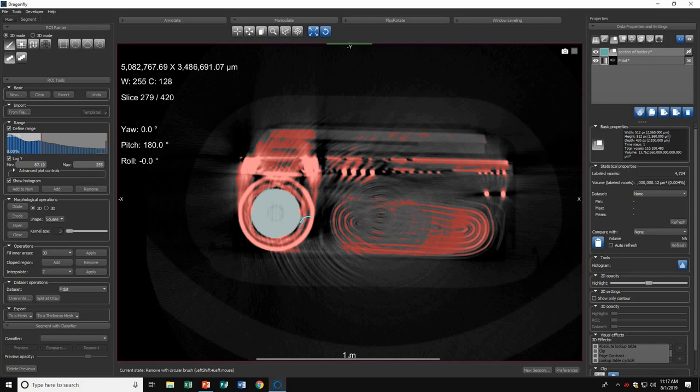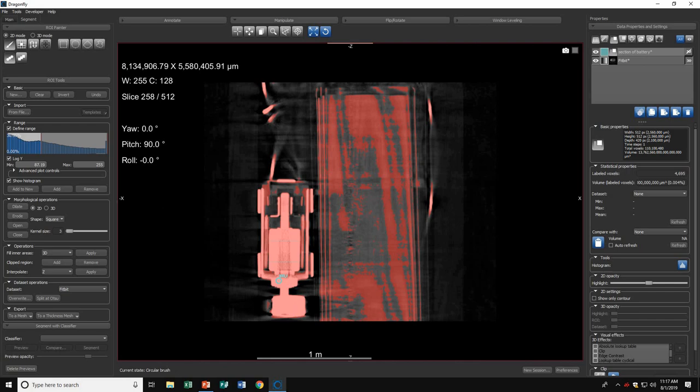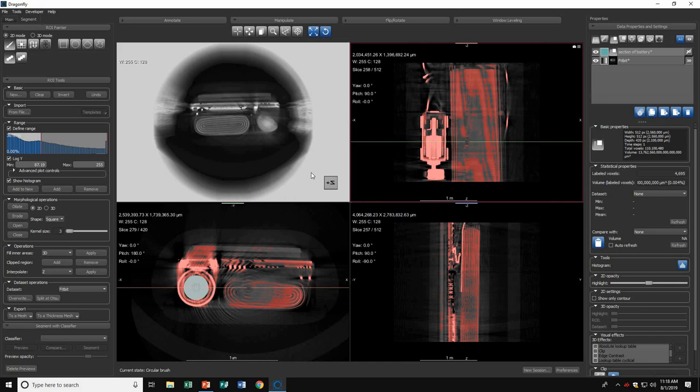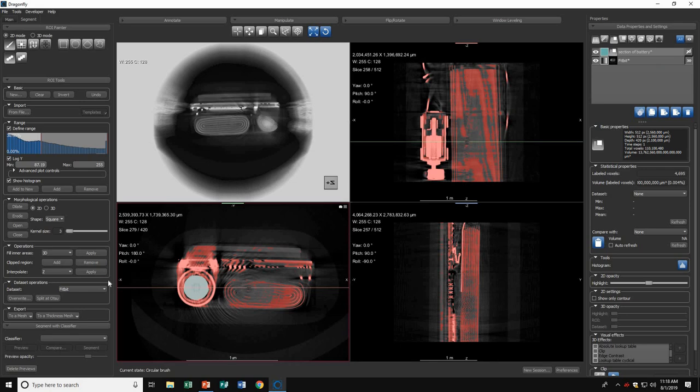That looks pretty good. Now I want to highlight the region between these two slices, but instead of going through each slice, a much easier way is to interpolate. This time I'll do it along the z-axis. Make sure you're on the right geometry and hit Apply.